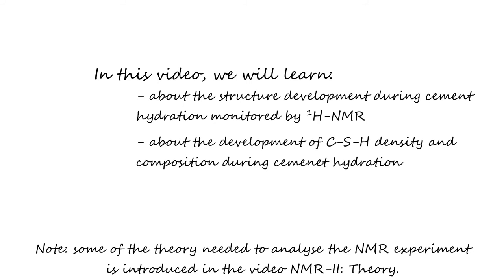In this video, we will learn how proton NMR relaxometry can follow the evolution of the different pore spaces during the sealed hydration of white Portland cement. Furthermore, we will look at the density of the CSH formed and its chemical composition.